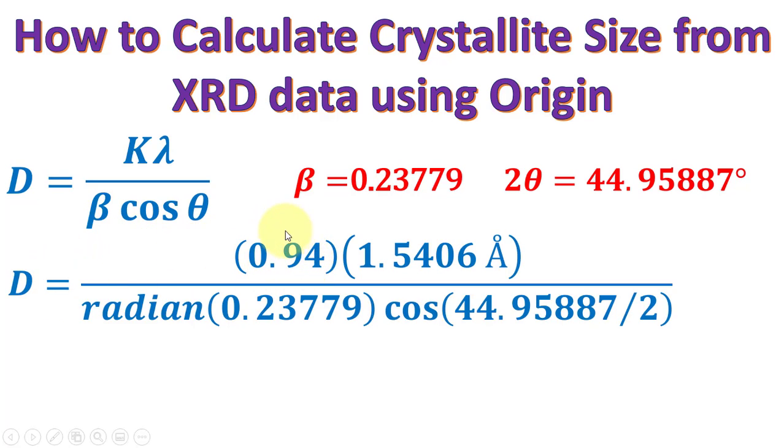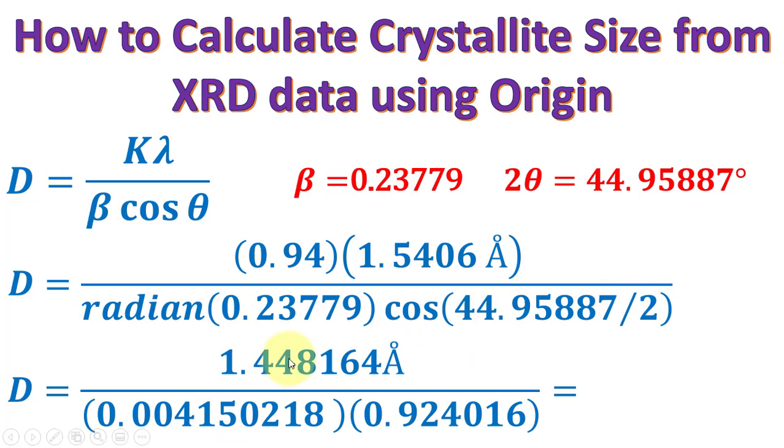D is calculated using K which is 0.94 for spherical cubic crystallites. This is the experimental value of the X-ray wavelength. I will take the radian of this value and then cos. Theta is there, so I will divide two theta by 2. As I calculate these values, the multiplication gives this, the radian gives this, and cos of this equals this. We calculate this in degrees, not radians. This gives us the crystallite size equal to 37.76 nanometers.